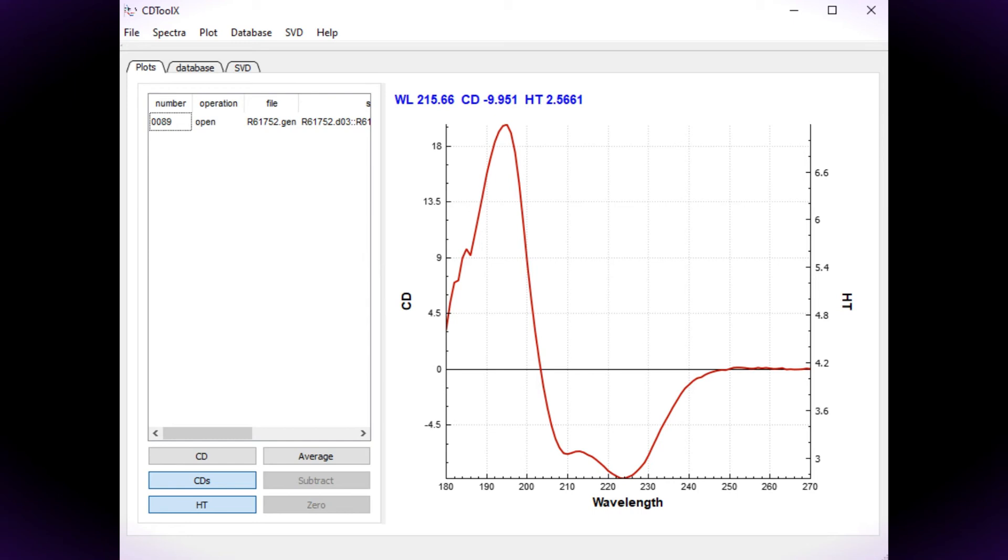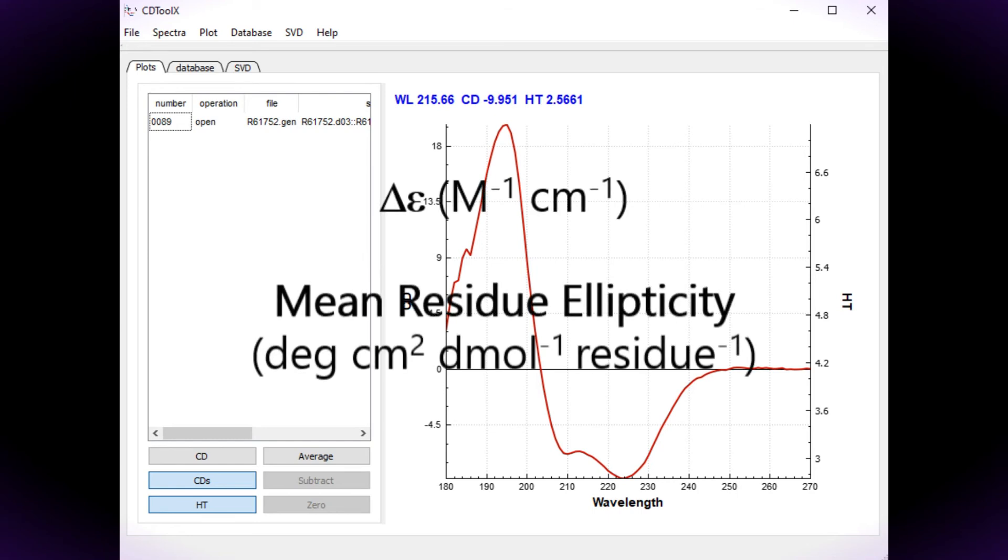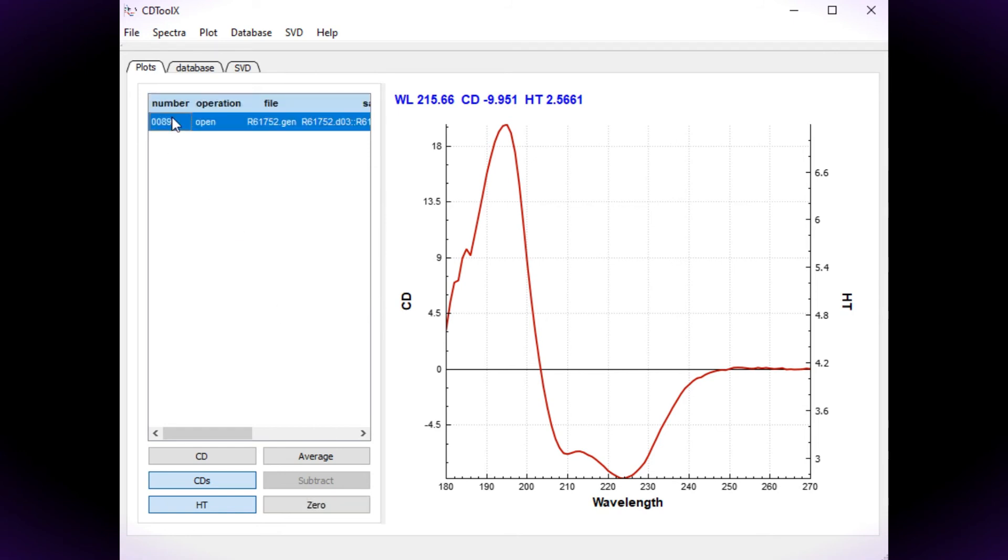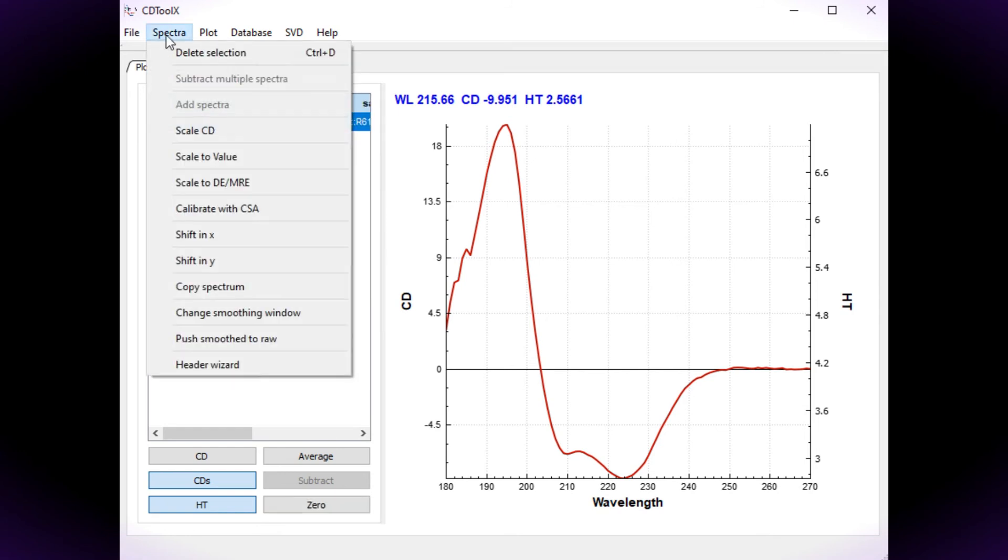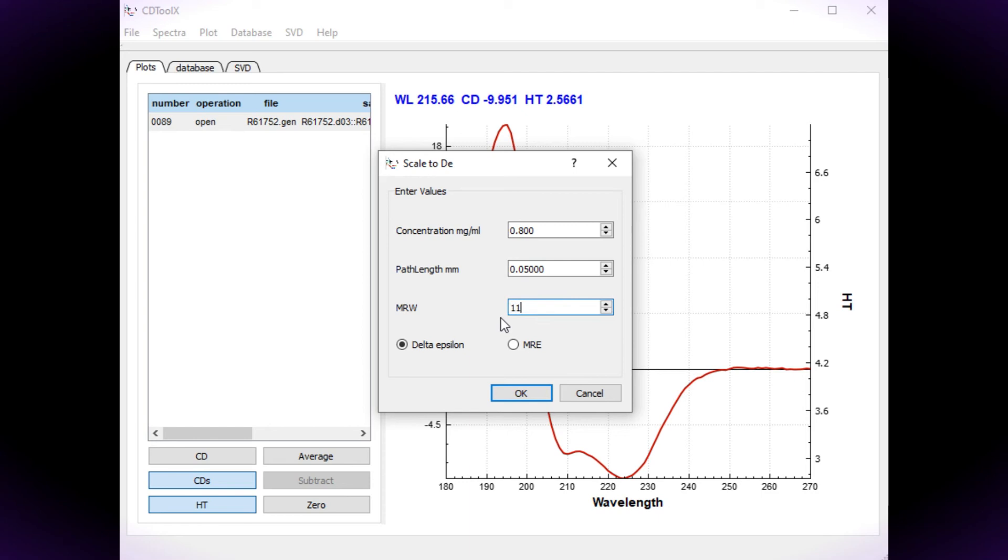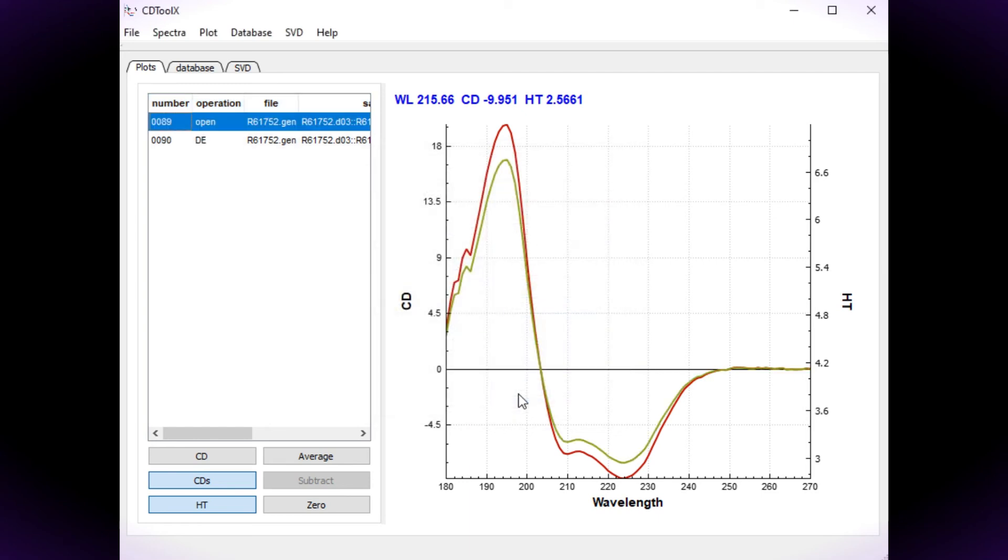Now the data can be scaled to standard units of delta epsilon or mean residue ellipticity which are independent of concentration, optical cell path length and the molecular weight of the protein. Select the spectrum. Choose scale to delta epsilon or MRE in the spectrum menu. Then in the dialog box enter the concentration in milligrams per milliliter, the cell path length in millimeters and the mean residue weight in Daltons. In this example the spectrum is scaled to delta epsilon units but there is also the choice of mean residue ellipticity.